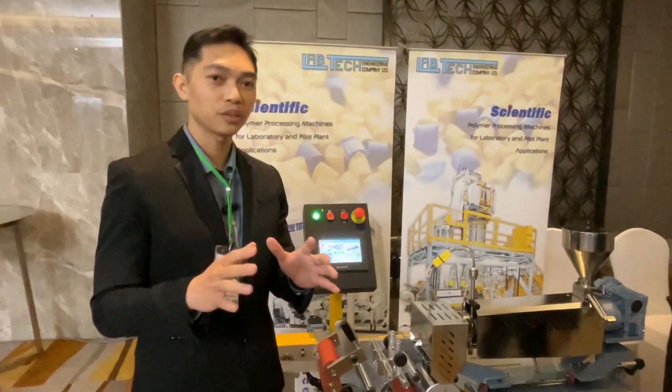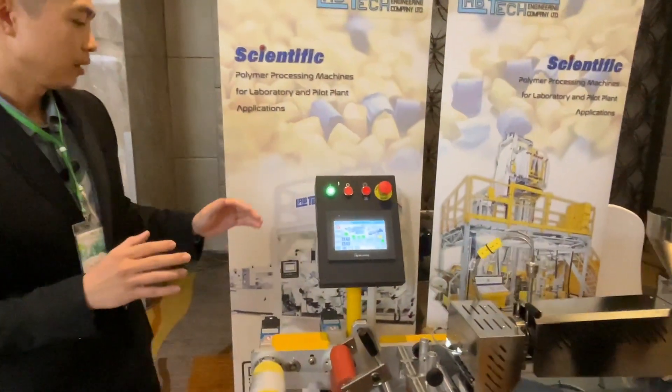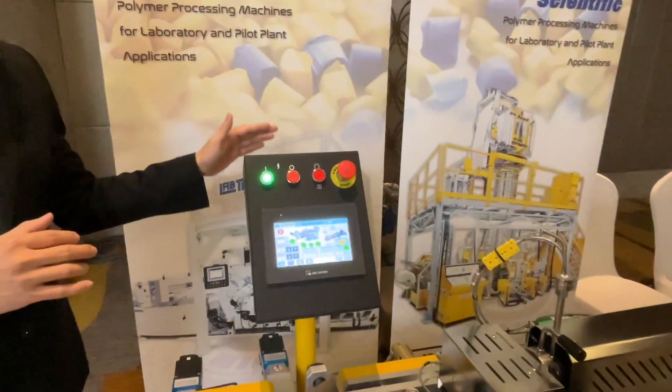Today I would like to introduce you to a very cool machine. This one is the mini cast film line.